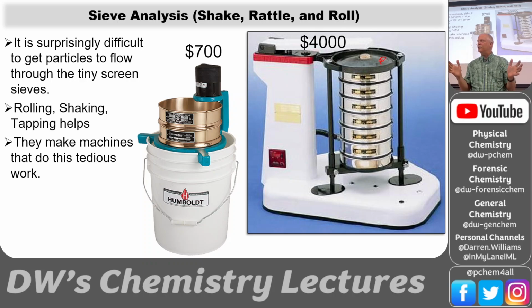It's incredibly tedious to try to do this by hand, so they make sieve shakers, what I call shake, rattle, and rollers. They spin the sieves, they vibrate the sieves, they thump them, and they have the water going through. Probably the loudest thing that we had in the lab at Pantex doing explosive particle analysis was this thing in the hood, rocking the whole stack of sieves, and there's a thing that's just tapping the bottom like what you would do with your fingers. It was like two metal plates with rubber tips on the end. It was like ping, ping, ping, rattle, rattle, rattle, and the water's going, passing the particles through.